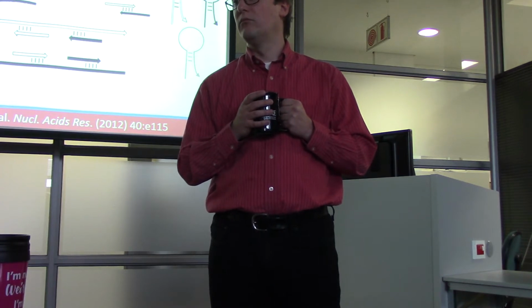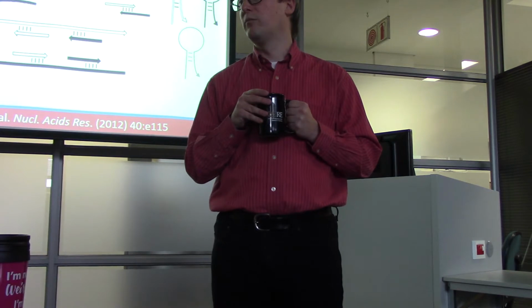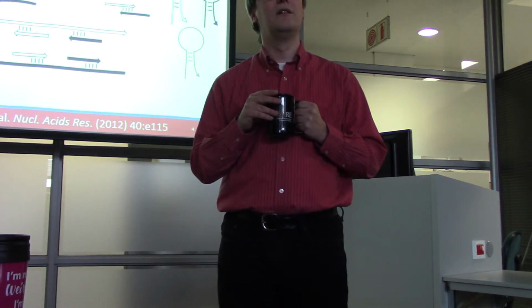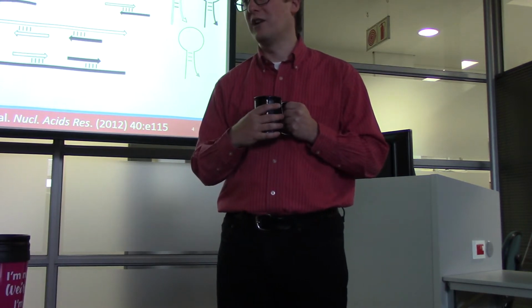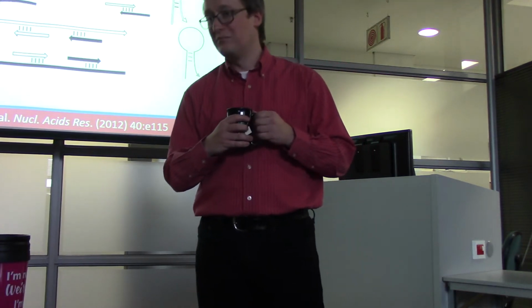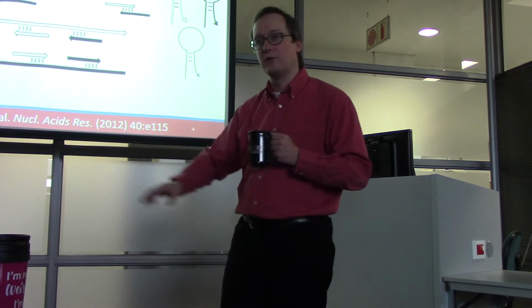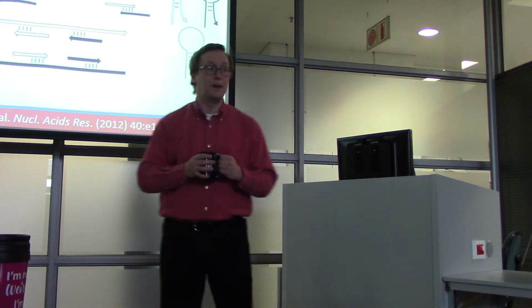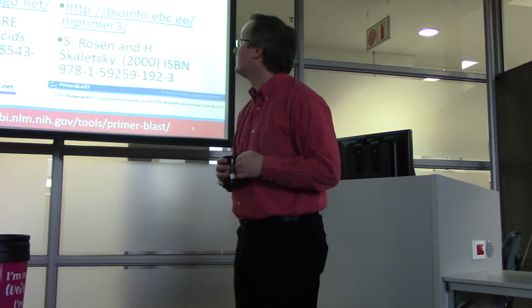Would you go for 50? If you multiplex it, yeah, I'm talking about multiplex PCR. You probably could. So the more targets we go after, the more difficult challenges like this become. This is principally a problem in that case.